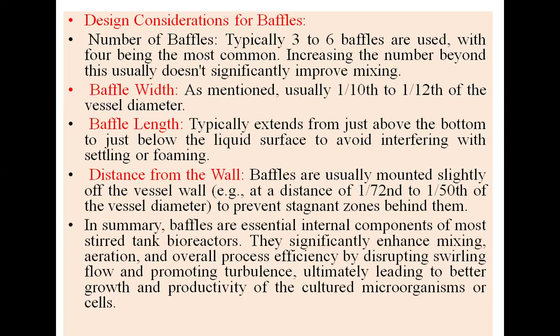To conclude, baffles are essential internal components of most stirred tank bioreactors. They significantly enhance mixing, aeration, and overall process efficiency by disrupting swirling flow and promoting turbulence, ultimately leading to better growth and productivity of the cultured microorganisms or cells. This is all about the baffles. I hope you understood the baffle content.